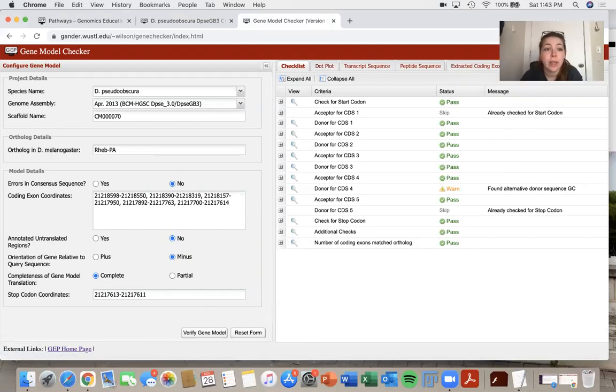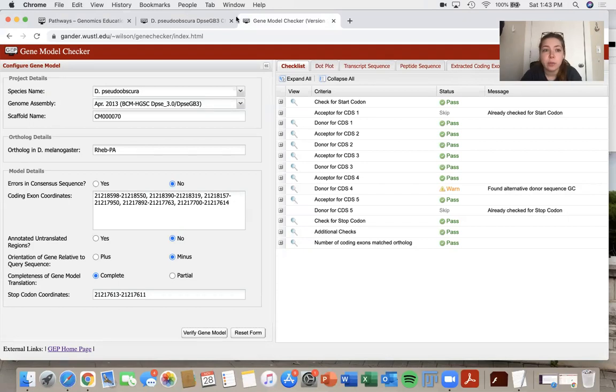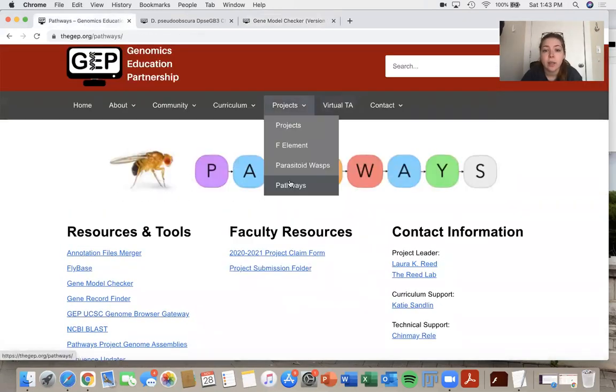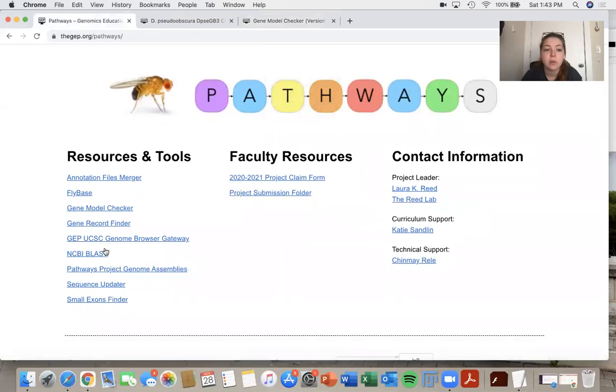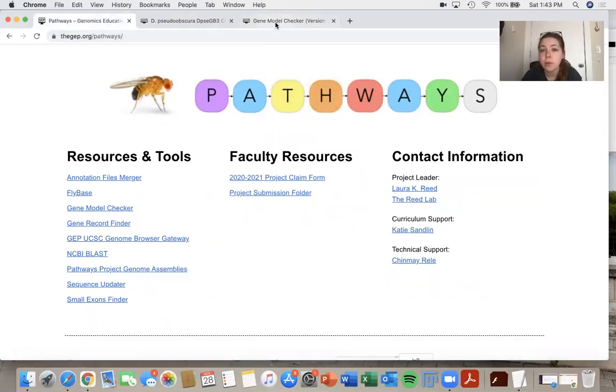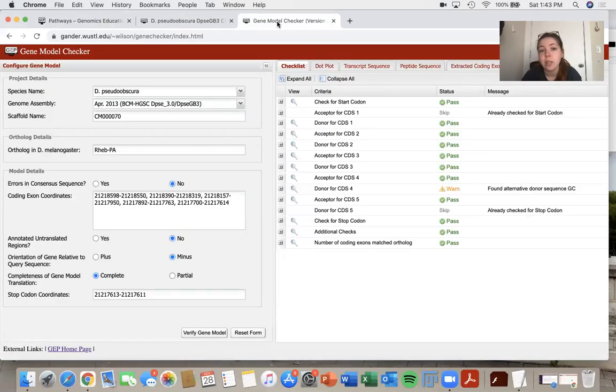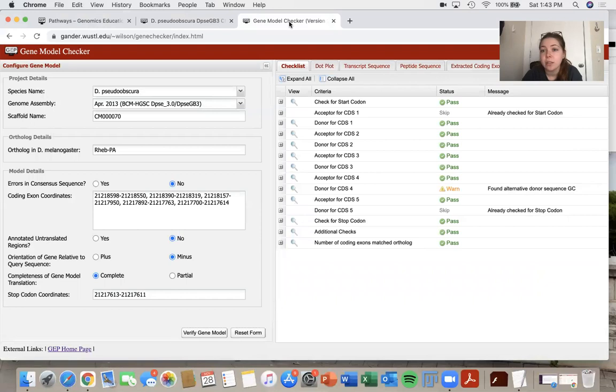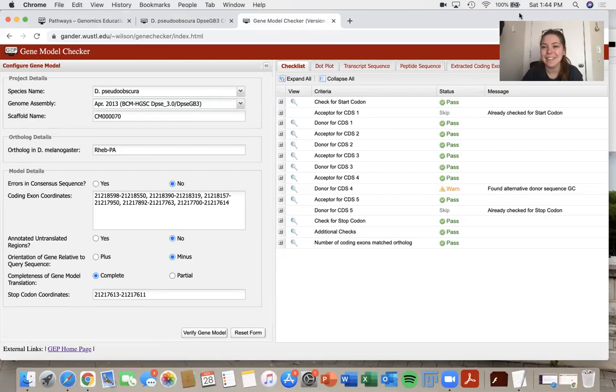So again, the places that we use, we first went to the GEP.org. We went to projects pathways, and we found all of our resources, the gene model checker and the genome browser are the most important for this right now. So here's our gene model checker, our genome browser. And I hope this was helpful. Thank you.